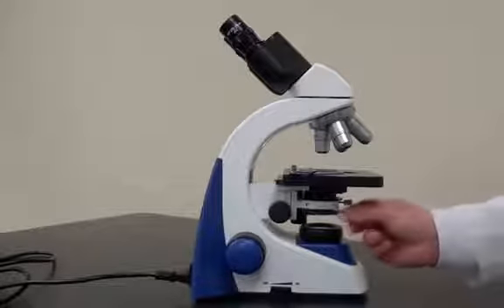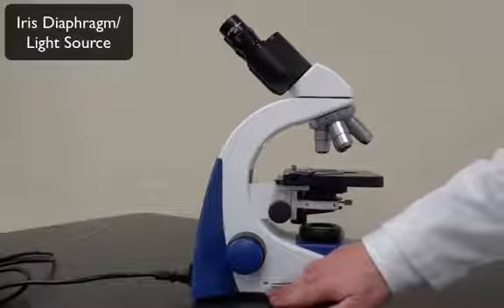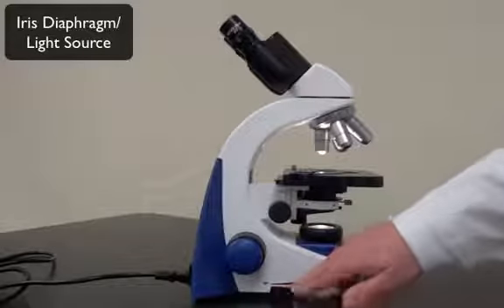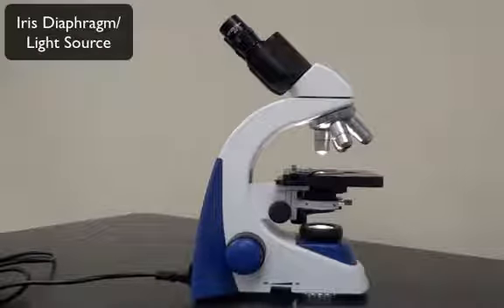If there's not one in there, you can just keep it locked into place there. Now one of the last pieces here is our light source. This turns on our light source here. You can see the light source come on. You can see the light shining up through the condenser into where the slide would be.